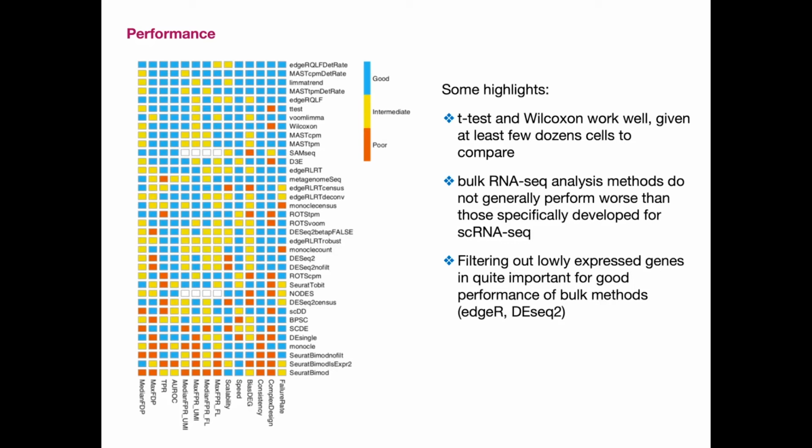I have just a small question here. What are these metrics on the bottom? Like Wilcoxon fails at complex design. Oh, so for the complex designs, because t-test and Wilcoxon, they only do pairwise comparisons. So if you need to regress mitochondria or add the batch effect to the model, that cannot be done in those tests. I see. That's what it is.